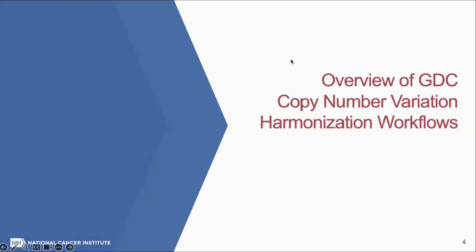Thanks, Bill. Good afternoon, everyone. This is Zhenyu, and I lead the bioinformatics team in the GDC. Today, I'm going to give an overview of all the copy number variation workflows we have ever used in the GDC.